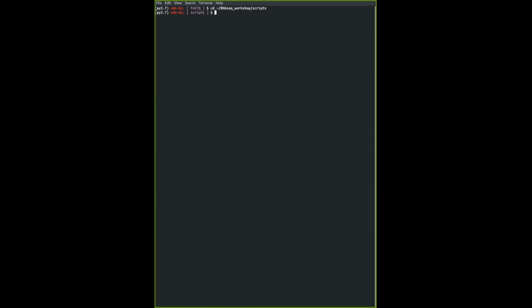Cool. So we're going to create a script file, and we're going to immediately use nano. We can just type nano to create a new script file, and I'm going to name it run_fastqc, and the extension for a bash script is .sh. It's short for shell. If you have a Python script, it's usually .py, and an R script is .r, as we have done a month ago. So we're going to press enter, and it creates an empty file in nano, and we can start to type our script.